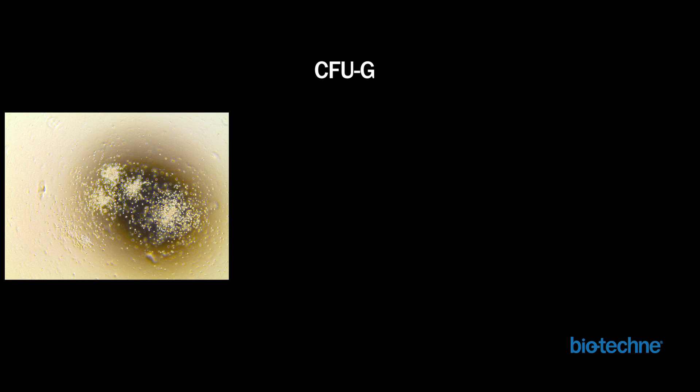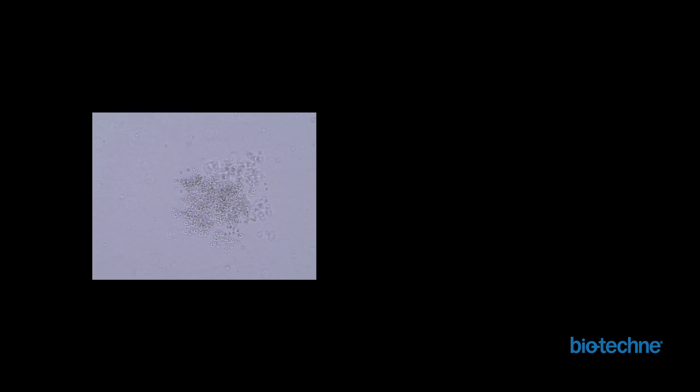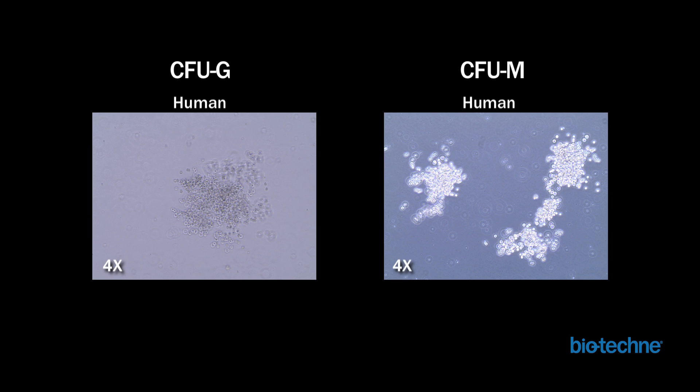CFU-G, or granulocyte colonies, can be distinguished from macrophage colonies by their smaller cell size and generally more compact centers, as seen in the images of human cell colonies on the left and in the middle. CFU-G colonies have a similar appearance in mouse cells as seen in the image on the right. The differences between CFU-G and CFU-M colonies can be clarified using a side-by-side comparison — human CFU-G colonies are clearly smaller in cell size compared to human CFU-M colonies. In addition, the granularity observed in CFU-G colonies is in contrast to the smooth, round appearance of macrophage cells.